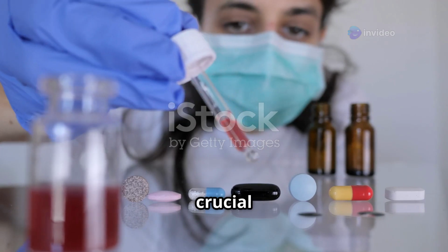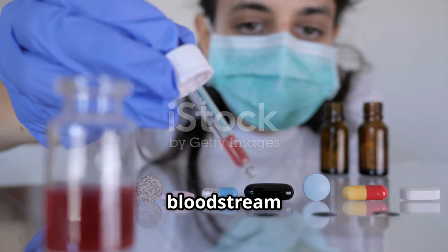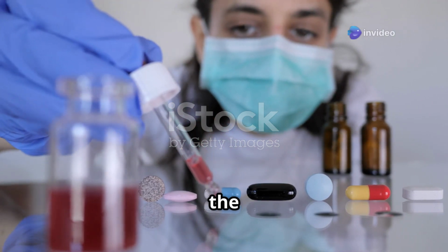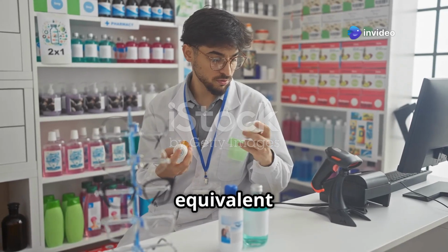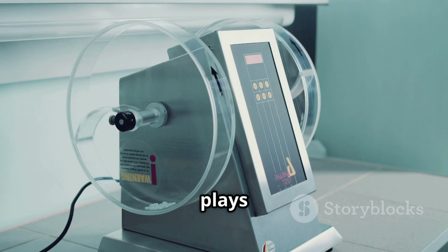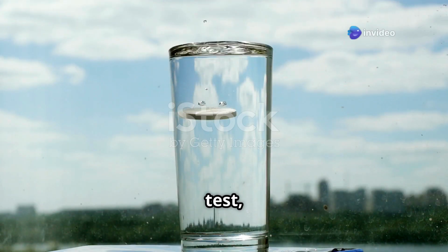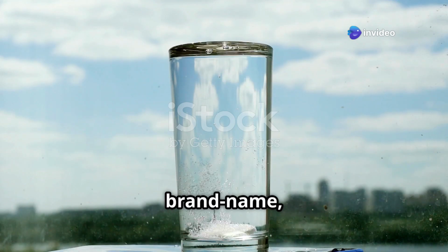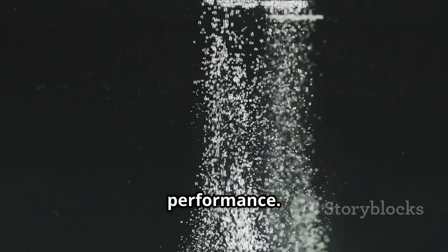Bioequivalence testing is crucial for demonstrating that a generic drug product releases its active ingredient into the bloodstream at the same rate and extent as the brand name drug. This ensures that the generic version is therapeutically equivalent to the original and will have the same clinical effect. IVRT plays a vital role in bioequivalence testing by comparing the dissolution profiles of the test, or generic, and reference or brand name drug products. The goal is to demonstrate that the two products exhibit similar drug release characteristics, indicating comparable in vivo performance.